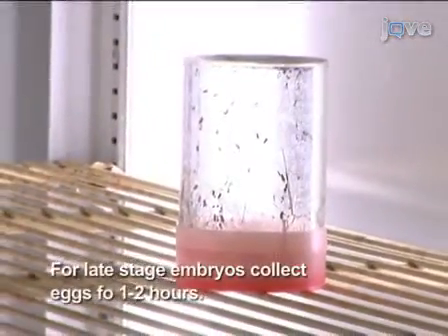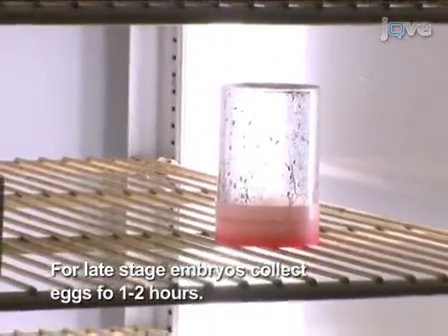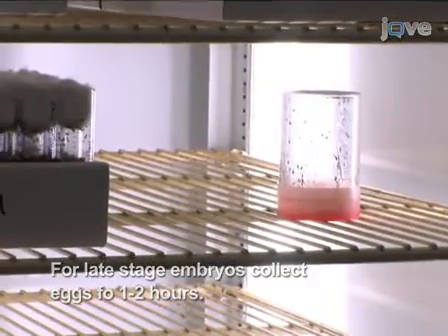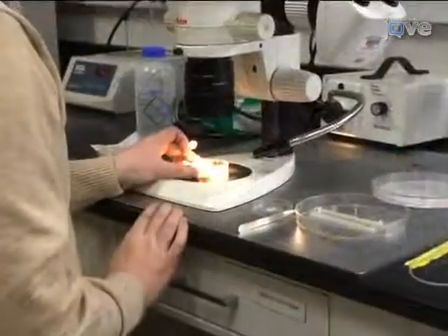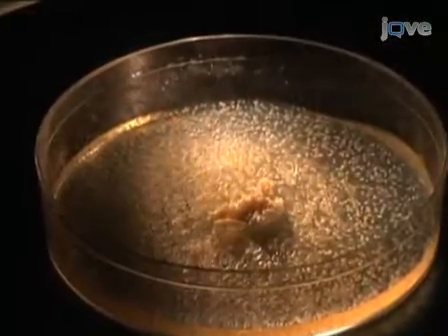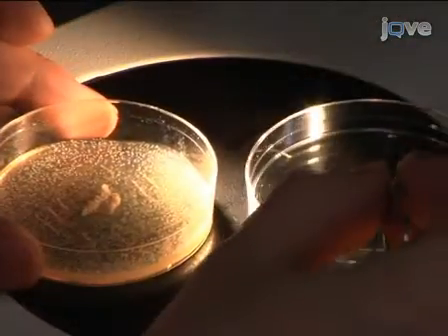For this procedure, the flies are allowed to lay eggs for 1 to 2 hours so late-stage embryos can be harvested, but this time frame will vary depending on the experiment. Embryo collection methods will also vary depending on the number of embryos needed. For dissection and electrophysiology, relatively few embryos are needed, in which case they can be picked gently from the plates with fine forceps.